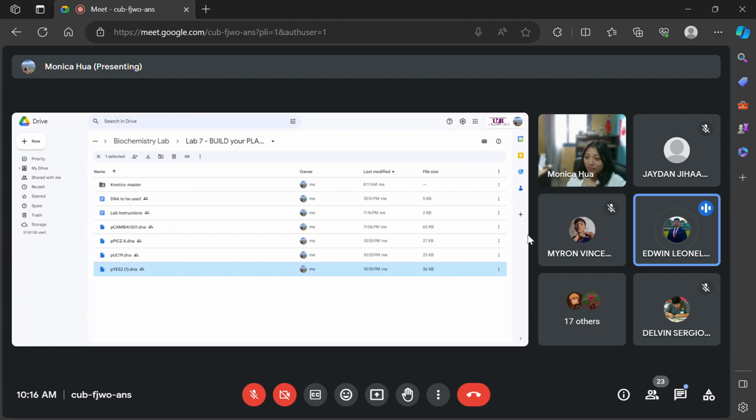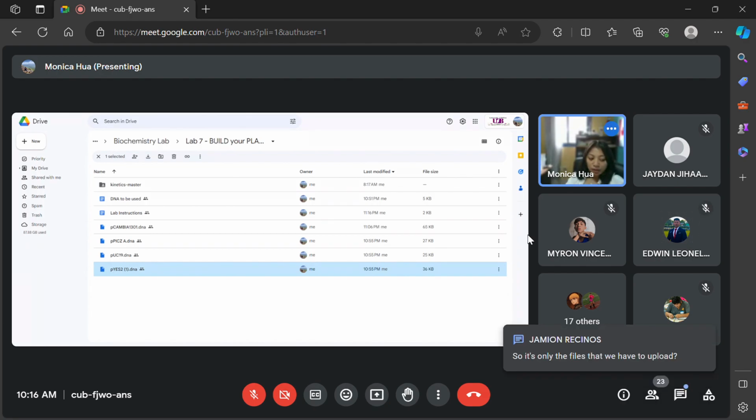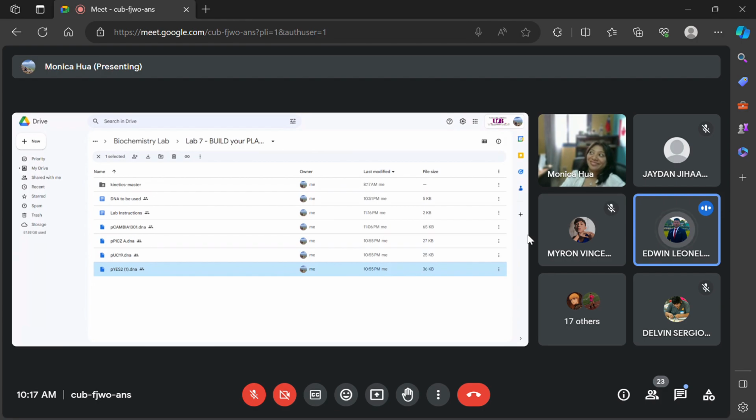These sequences are built on SnapGene. SnapGene all it does is put the sequence together, and because you could download these sequences from anywhere, the ATG, the DNA sequence. SnapGene just makes it look pretty. It's more like a compiler in a way.